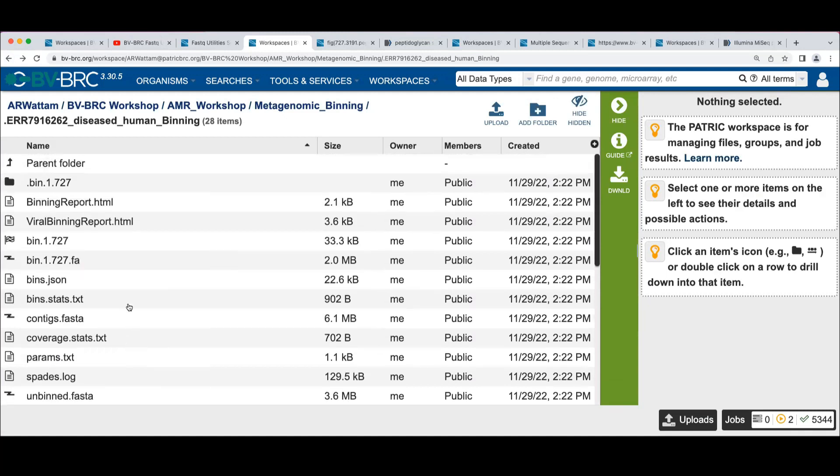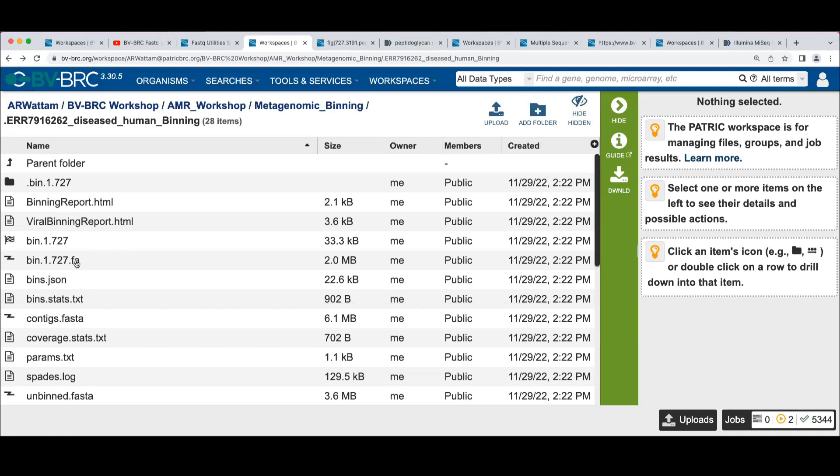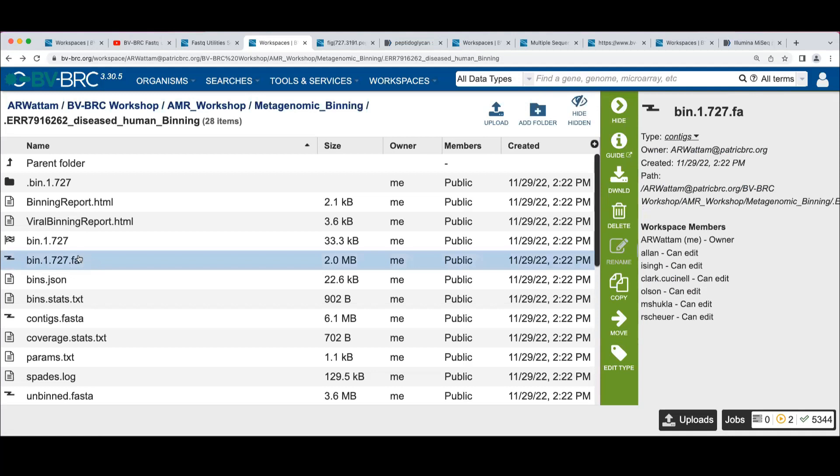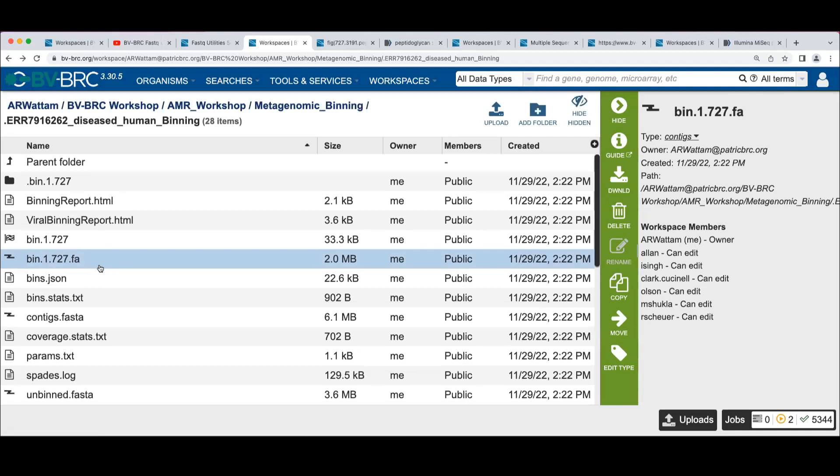So the other thing that is in here are the actual bins themselves, right? If I wanted to do further analysis with the data, I'd want to have the actual FASTA file of the bins. And that's what here we have this bin 1727. This is bin one of the 727 is the tax ID of the genome that we're running. And so here we only had one bin, so we only have one bin file.